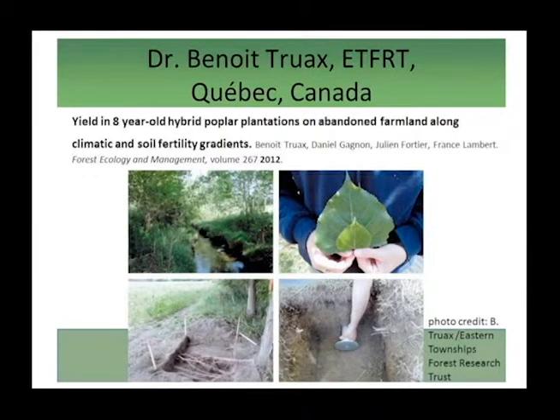And you can also see that they collected other data besides just using the handheld photosynthesis system. So they did soil cores and did root density studies as well.